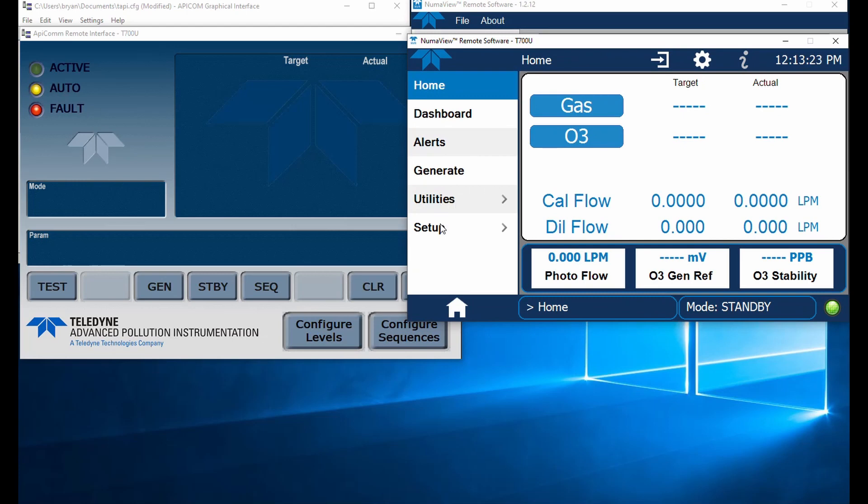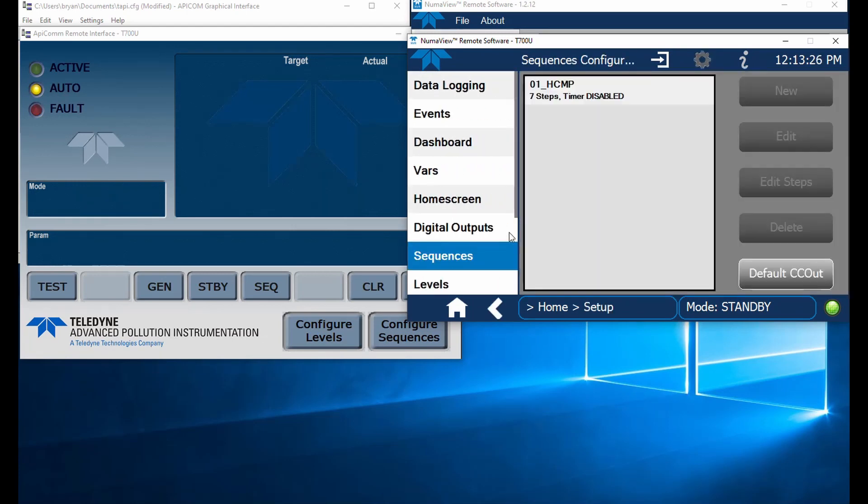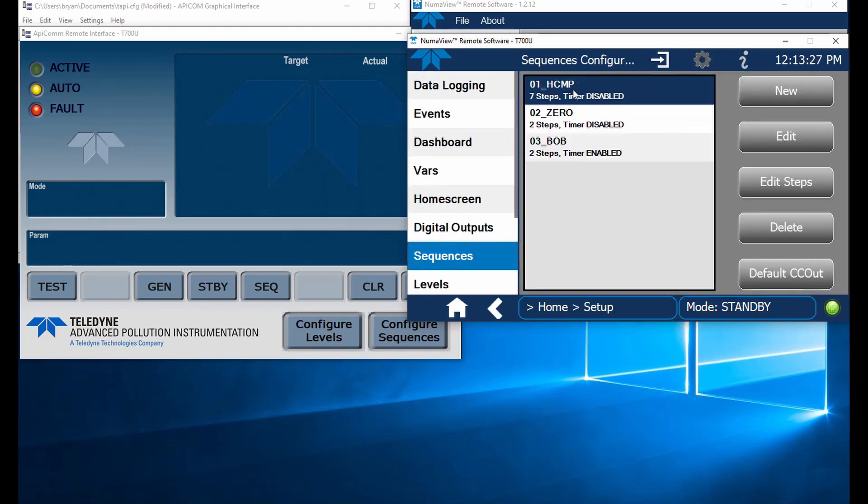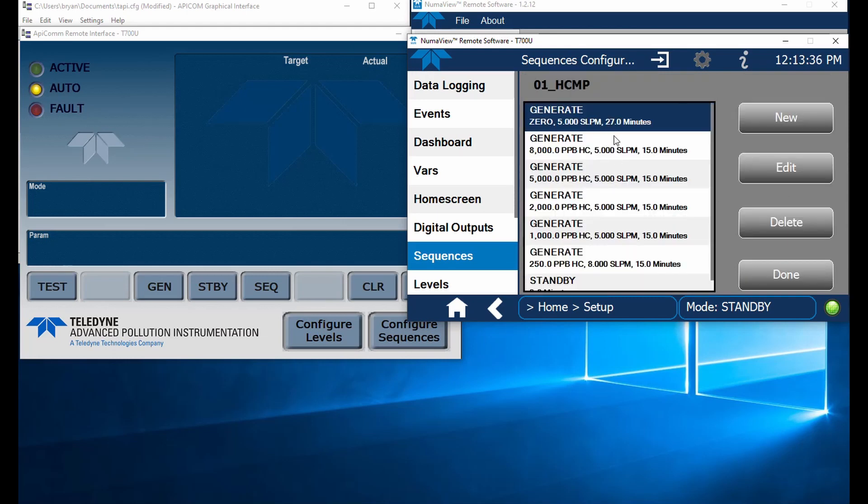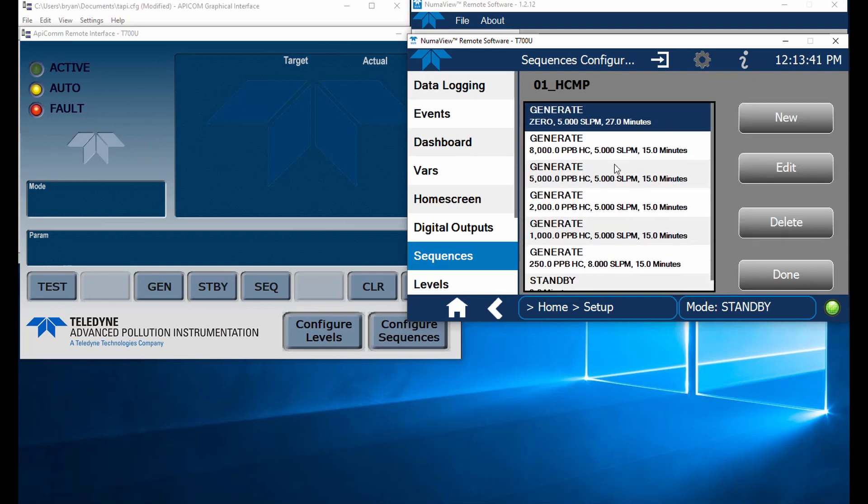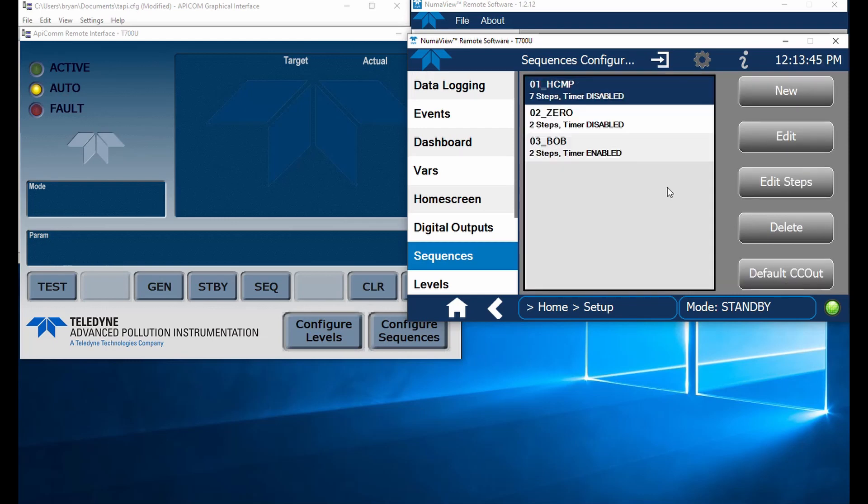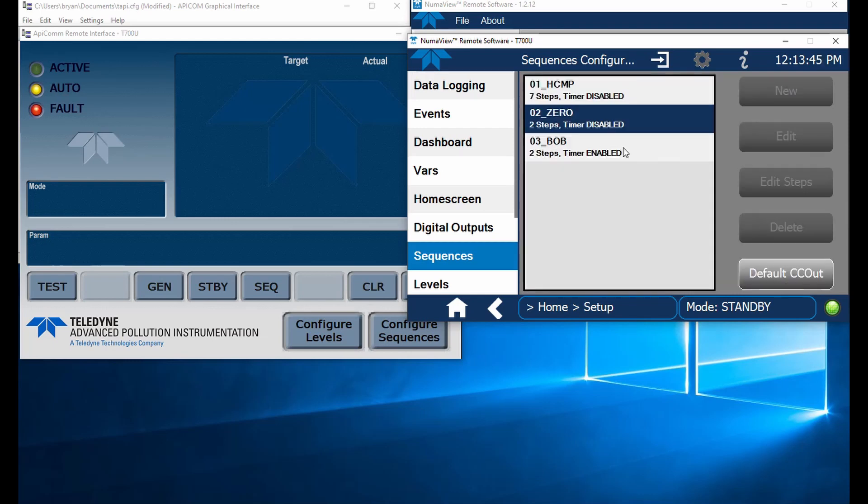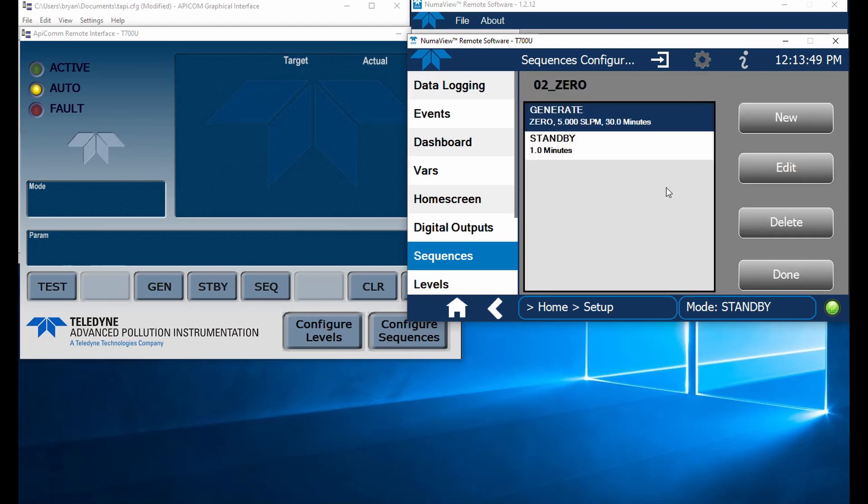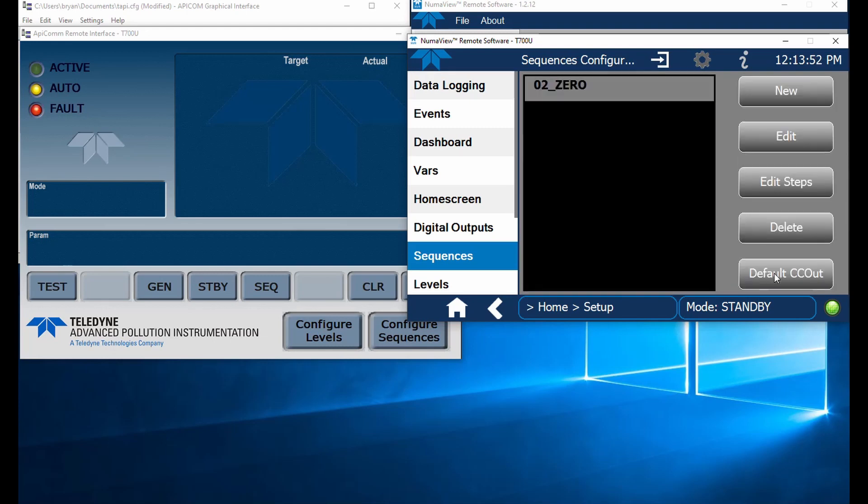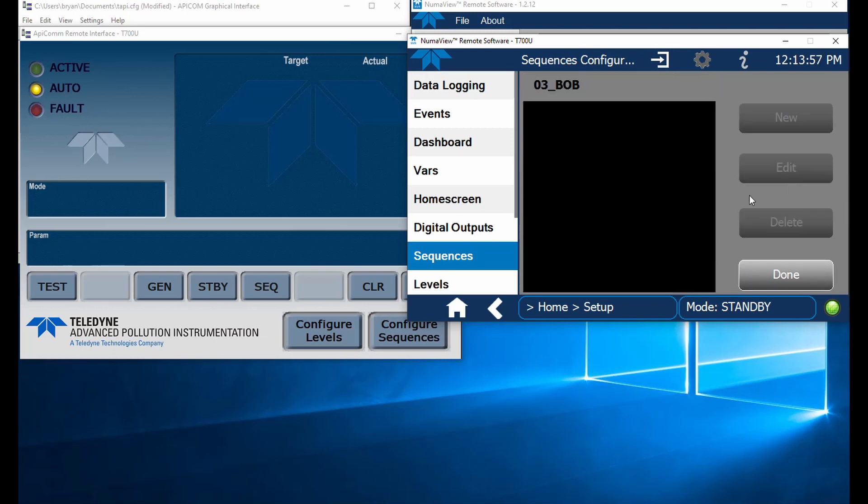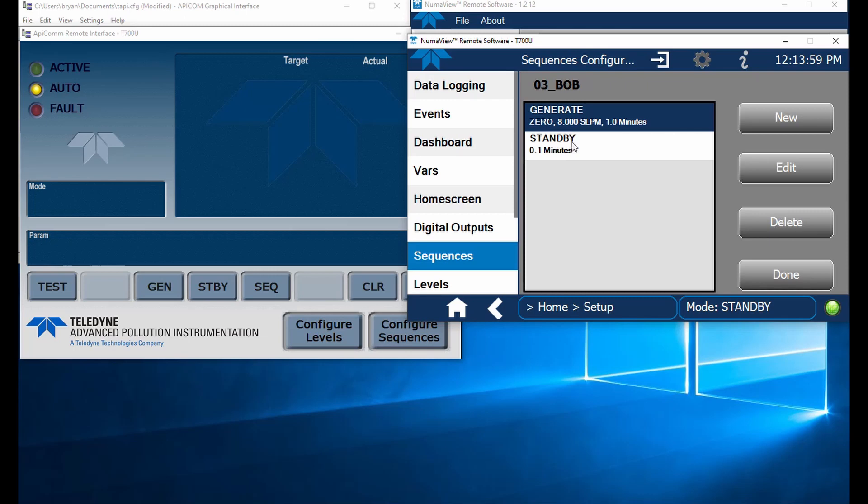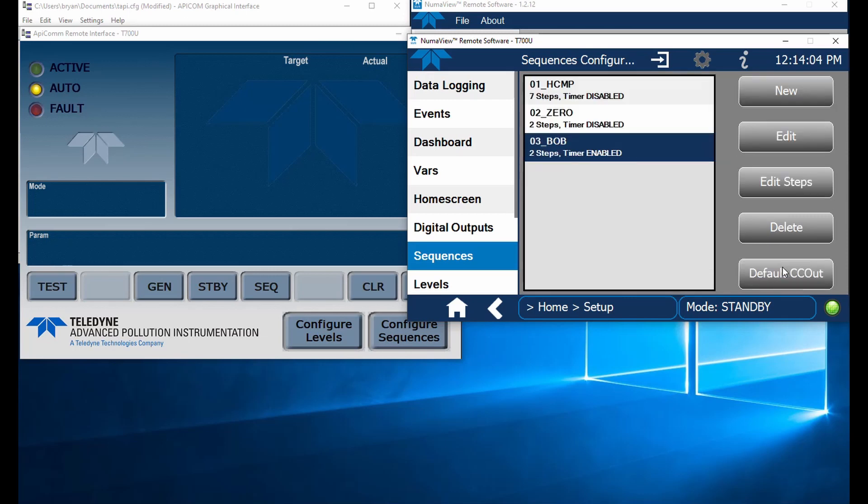So when we go into my calibrator, we're going to see that I've got three sequences set up here. I've got my hydrocarbon multipoint set up with seven steps. We've got a zero, a few dilution points, and a standby down here. This one happens to be running for 27 minutes for this zero. I've got another one called zero that's got a couple of steps. Generate zero and then go into standby. And then another one called bob because why wouldn't you have a calibration sequence called bob. Also generates zero at eight liters for a minute, goes into standby.